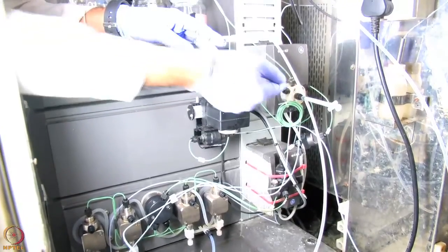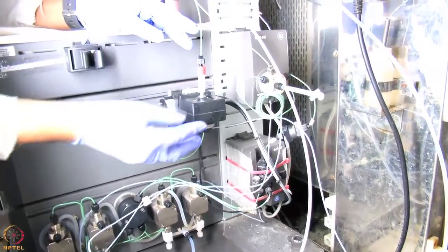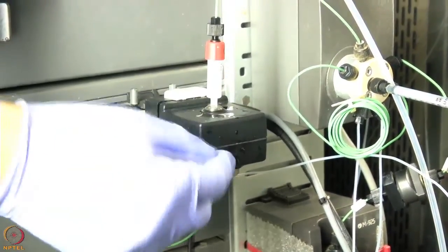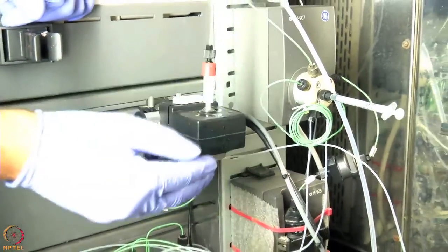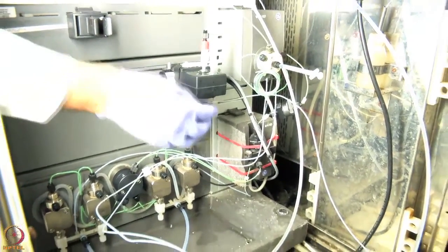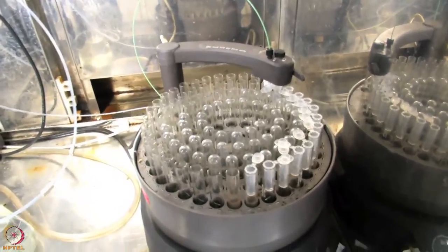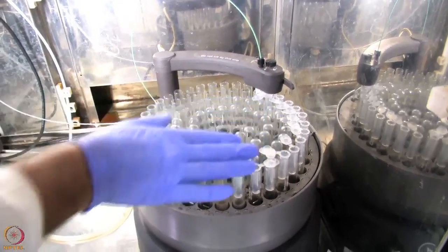The sample will come from the injector valve and go through this column. This is an affinity column, and then there is a flow cell which can measure the conductivity and pH of the sample, and the UV detector. When the sample passes, we can measure the UV to see whether the protein is coming or not. We can measure the pH, whether the pH of the buffer is changing as we change the buffer, and the conductivity if we are using different amounts of salt. From here the sample will pass to the fraction collector. This is the tube which comes from the flow cell and goes to the fraction collector. At 280 we collect the sample, so it will collect the sample in the tubes.